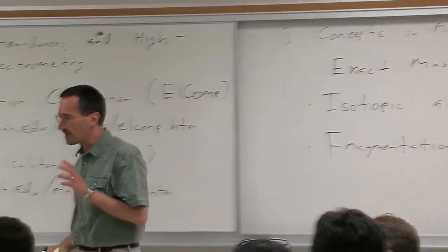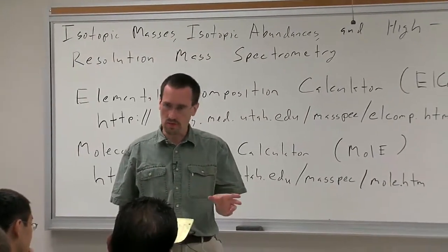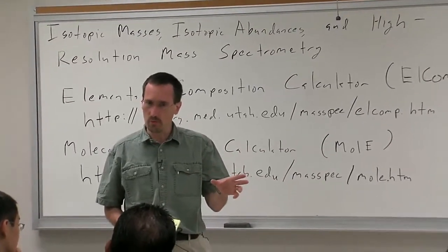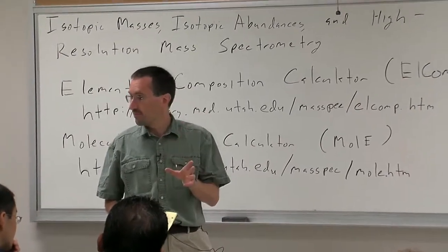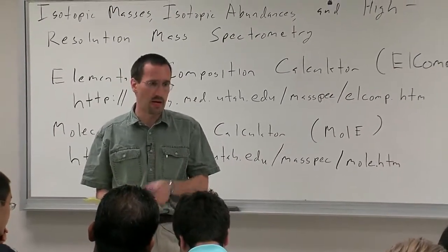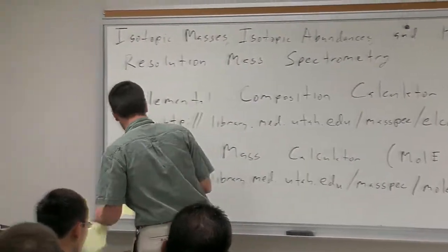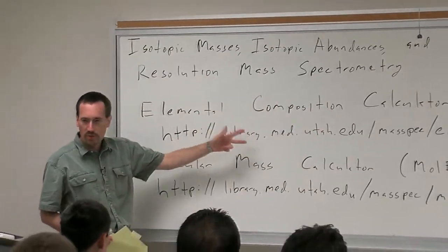And given the fact that in soft ionization techniques, you don't generally get a lot of fragmentation, fragmentation isn't super important there. But in EI mass spec, where you have tons of fragmentation, you often can't even see your molecular ion. It's very important.